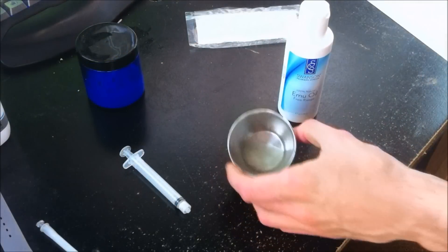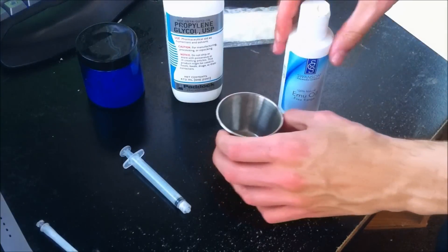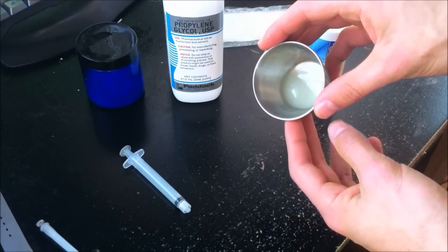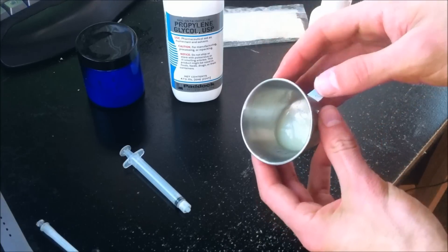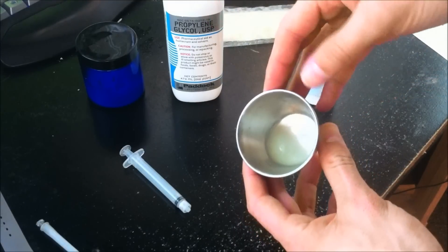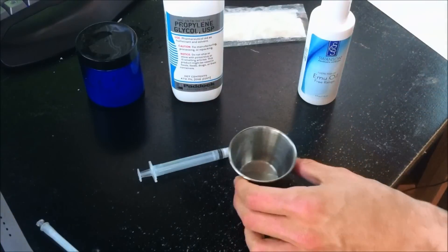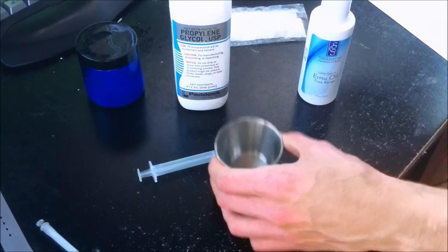My camera ran out of space and cut me off. Anyway, I was right at the part where I was about to mix the propylene glycol with the emu oil and see what it looks like. At first it's going to be rough estimates so that we can develop some figures about what a good ratio is and what that ratio will result in in terms of how liquid it is. Let's go ahead and add a little bit of propylene glycol and see how it goes.